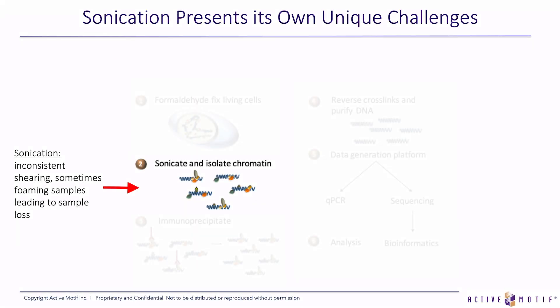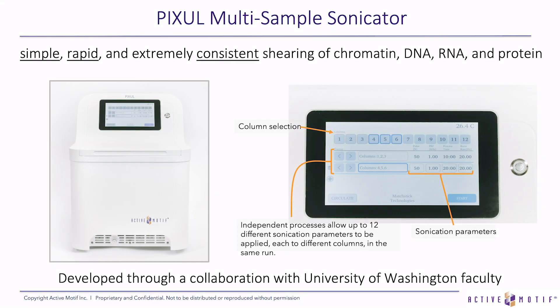Another step in ChIP that presents unique challenges is sonication. A lot of times ChIP assays fail because your sonication was inconsistent. Inconsistent shearing sometimes leads to foaming samples. If you accidentally touch the probe of the sonicator to the side of the tube, there are cooling issues with keeping your samples always at 4 degrees, whereas sonication tends to heat up your samples. All of these problems can lead to inconsistent results and sometimes failed experiments.